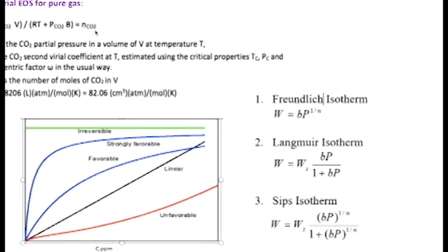By calculating the amount of gas adsorbed, we can now characterize the behavior and the relationship of the adsorption process between the adsorbent and the adsorbate by trying to fit the data to adsorption isotherm plots, in which the concentration of the adsorbate in the adsorbent particle, denoted by W, is plotted against the concentration in the fluid gas, denoted by C.